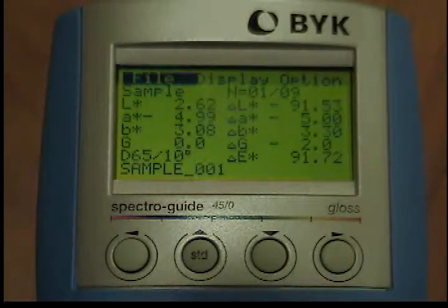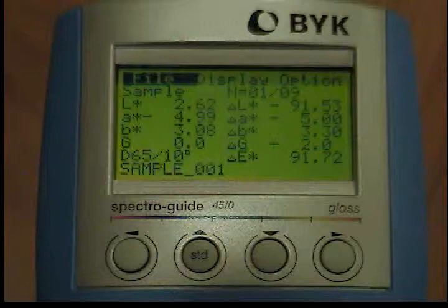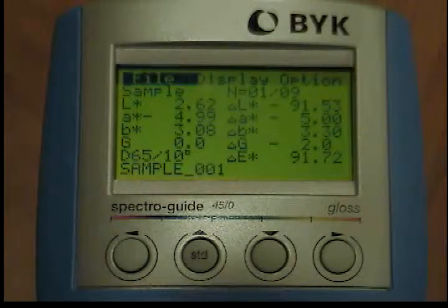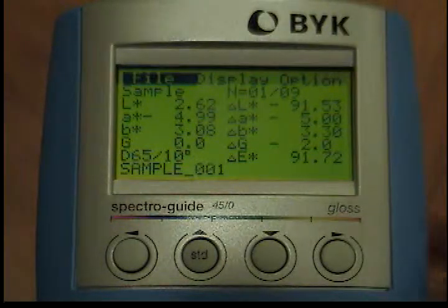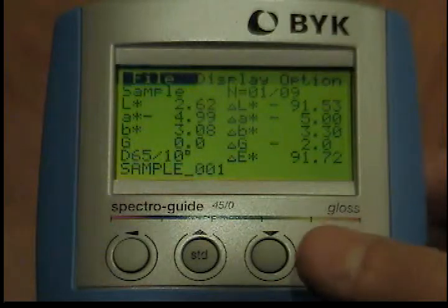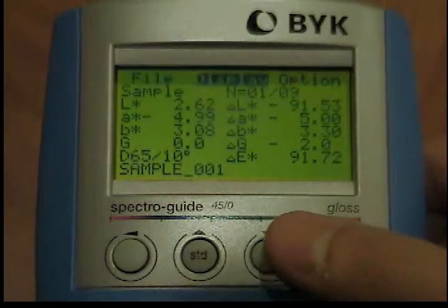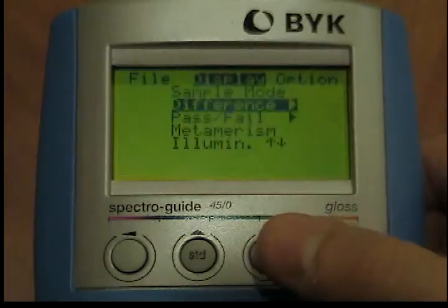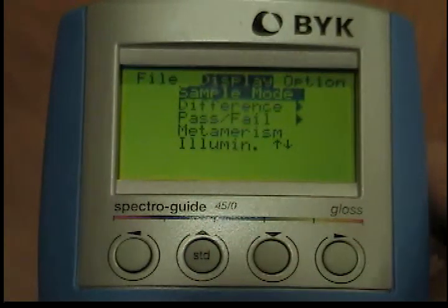Using the display setting on your BYK-Gardner Spectro Guide. The instrument is preset to the difference measuring mode. To get to the sample mode from the display menu, use the down button to move the cursor to the sample mode option. When you press the operate button, the display will change to sample mode.